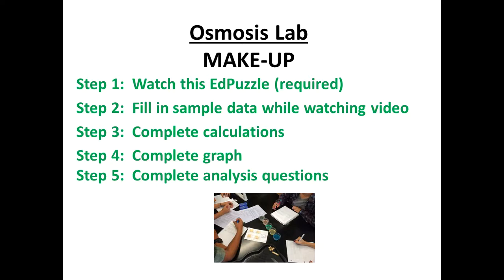And since you missed actually completing the lab, it is required that you watch this video so that you know what the lab's about. Step two is while you're watching the video, I'm going to give you some sample data that was actually collected during lab earlier this week. So in your data tables, you're actually going to use the data from this recording. So you'll actually want to write in any numbers that I go over because this will be your data that you're using for lab.